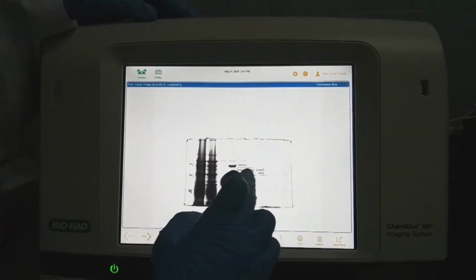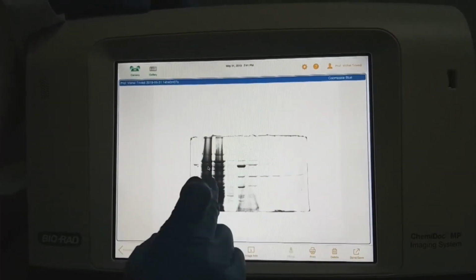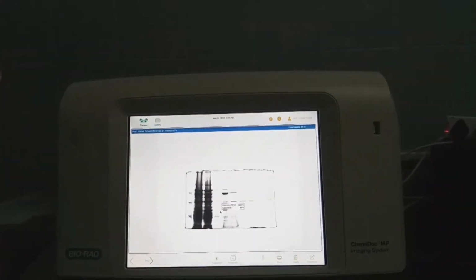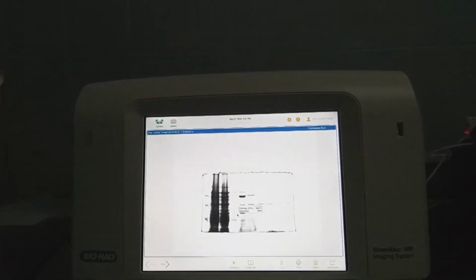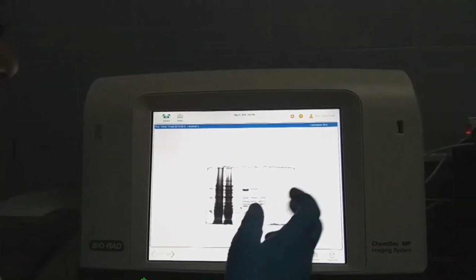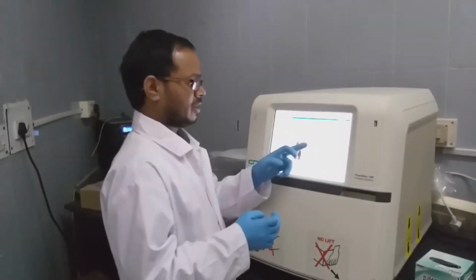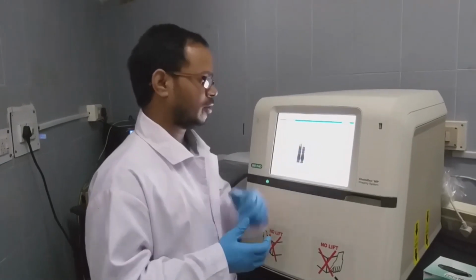As we can see, the protein corresponding to this purification, the His-tagged one, is going mostly in the flow through. So, as I said in the video earlier, we can use this flow through again for purification of the protein. You can incubate this flow through with the same beads and repurify, so that will increase the productivity of getting the protein.